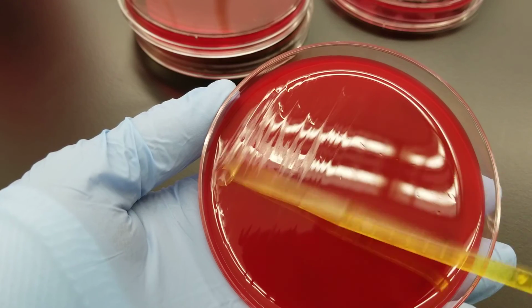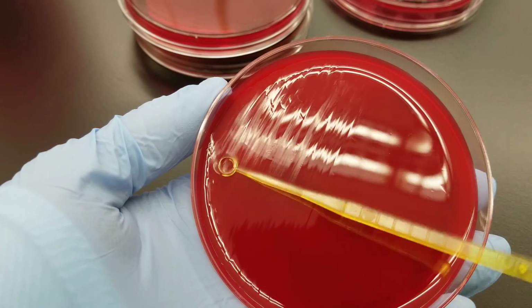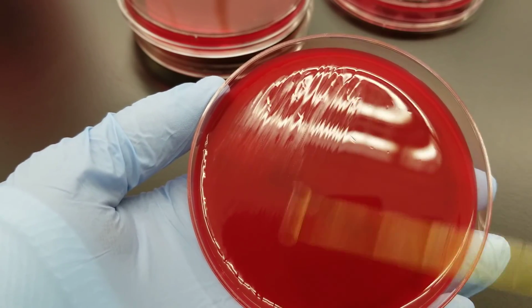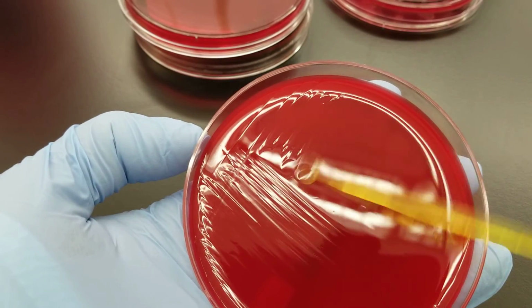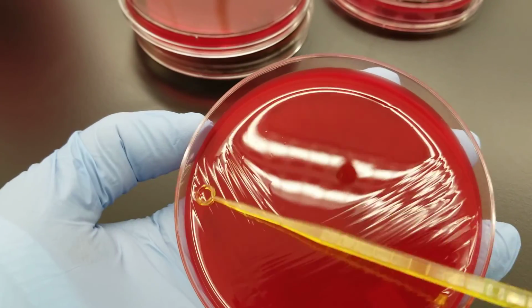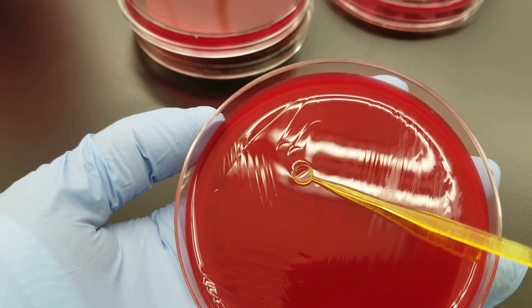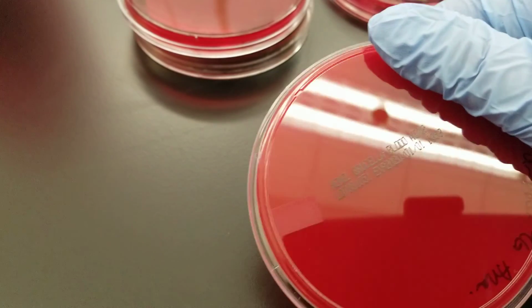Again, there aren't any antibiotics or ingredients that I could be transferring through to these plates, but you're doing this order of inoculation because you want to know if the organism did not grow on the Brucella blood agar plate.